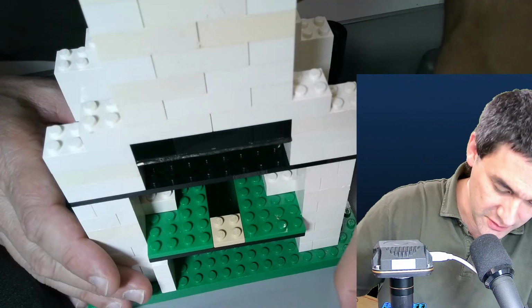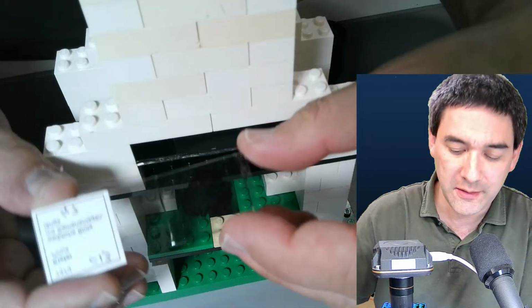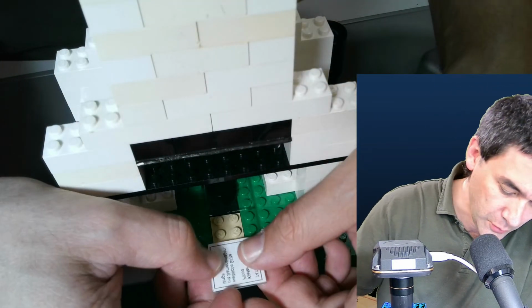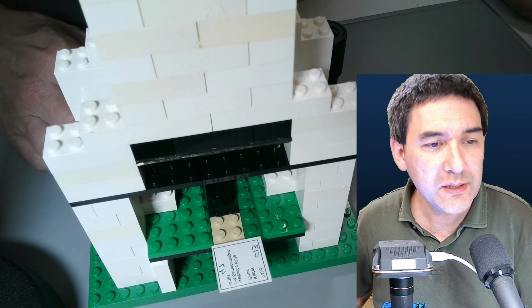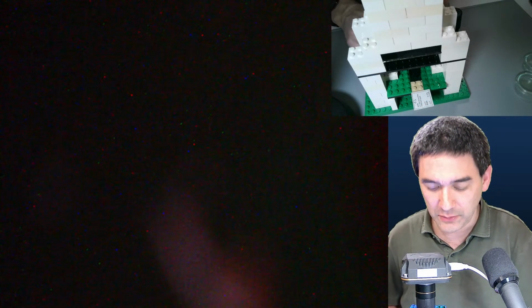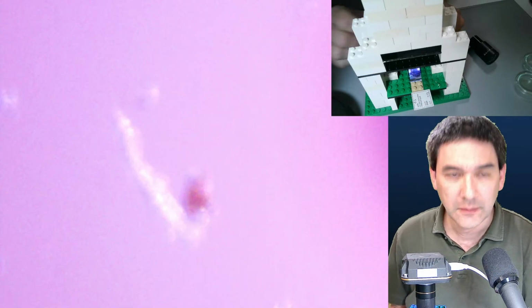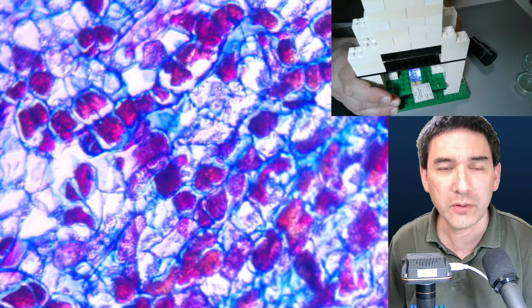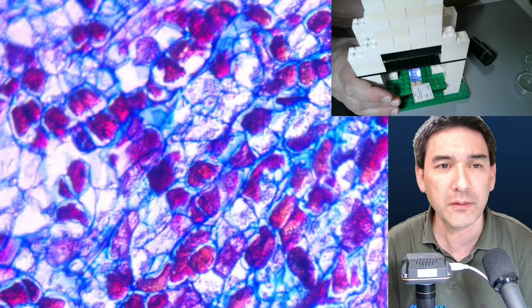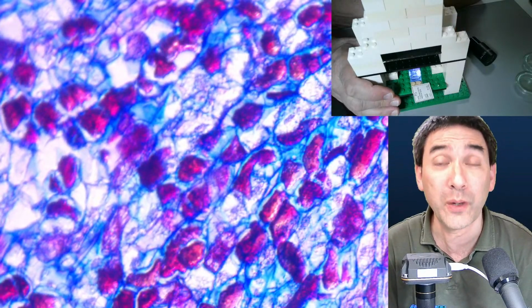This here is a slide of a pine flower, and if you put it in here again, and if you switch over, where is it? Here it is. Okay, I'm going to add the lamp at the bottom, and of course with the LEDs that's not always very centered, and then you can get yourself an image here. If the light comes a little bit from the side, then you're getting something a little bit like oblique illumination. But actually, the homemade microscopes work quite well.